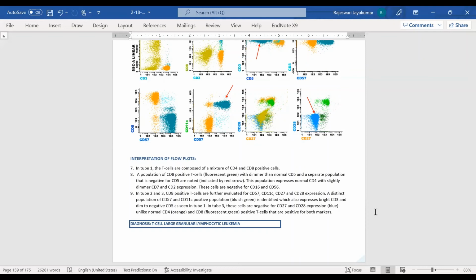So just by flow cytometry, the only thing you can establish is if you see a population of LGLs, and if it is a considerable percentage, then we report that percent, and we say correlate with T cell receptor PCR and clinical presentation. Then they'll go back and see if PCR turns out to be polyclonal, monoclonal, or oligoclonal, and they'll follow up to see if the patient has any autoimmune disease that is causing LGL expansion, or any other reactive conditions that are causing LGL expansion. And when they rule out all other possibilities, they will call this leukemia. And this is also an indolent leukemia, so clinicians usually take their time in making this diagnosis.